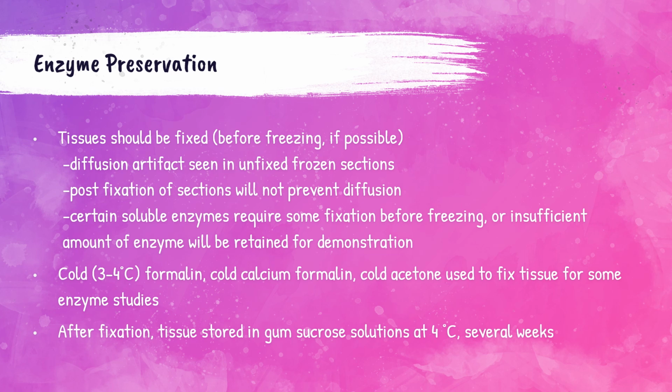In an ideal situation, tissue that is used for the demonstration or detection of enzymes should be fixed. It should be fixed before freezing if possible, as diffusion artifact may be seen in unfixed frozen sections. Also, post-fixation of sections will not prevent diffusion. Certain soluble enzymes require some fixation before the freezing of the sample, or an insufficient amount of enzyme will be retained for demonstration. Some enzymes will be inactivated by even the smallest amount of fixation.